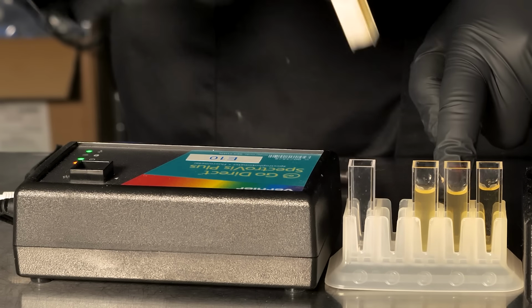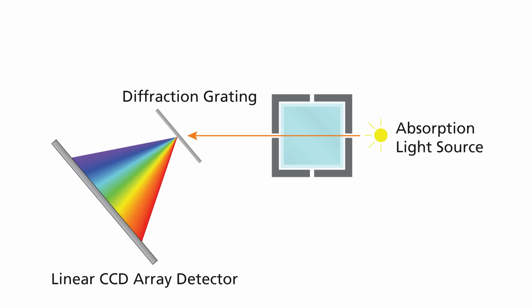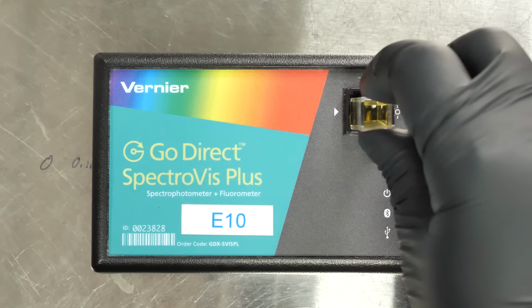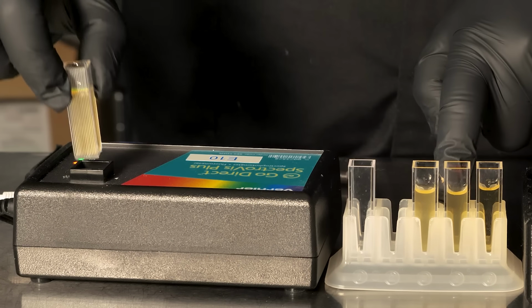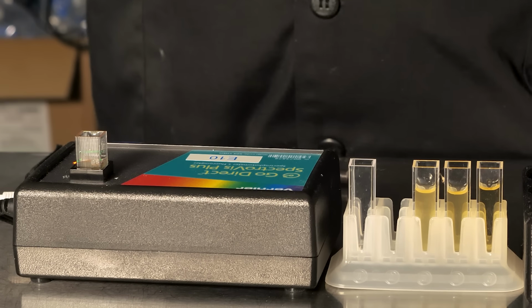We can check to see where they're at by using a device called a spectrophotometer. It's basically just a light and a photodiode, and it'll measure how cloudy the solution has become by comparing between pure LB solution and our bacteria solution. This cloudiness is called the optical density, and we're looking for around an OD of 0.5. You can totally learn to eyeball this with enough practice, which is how I used to do this, but if you want the absolute best results, a spec is helpful.